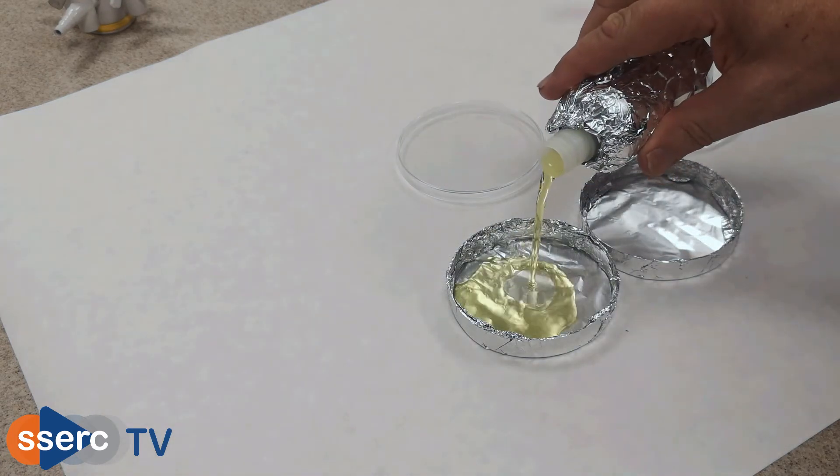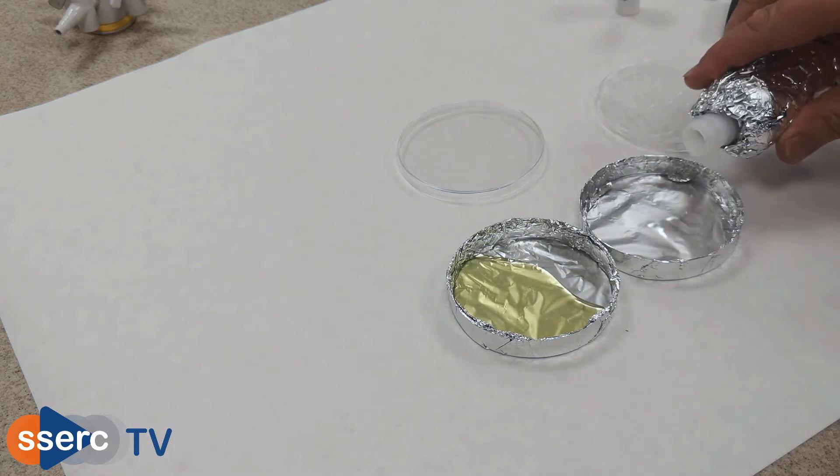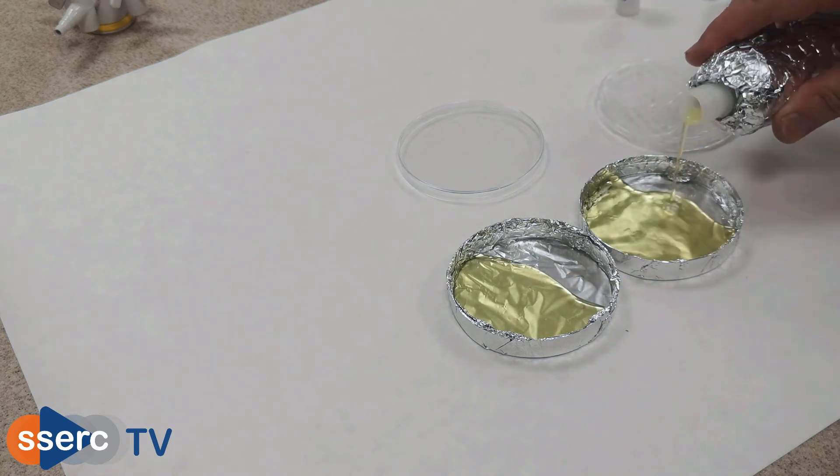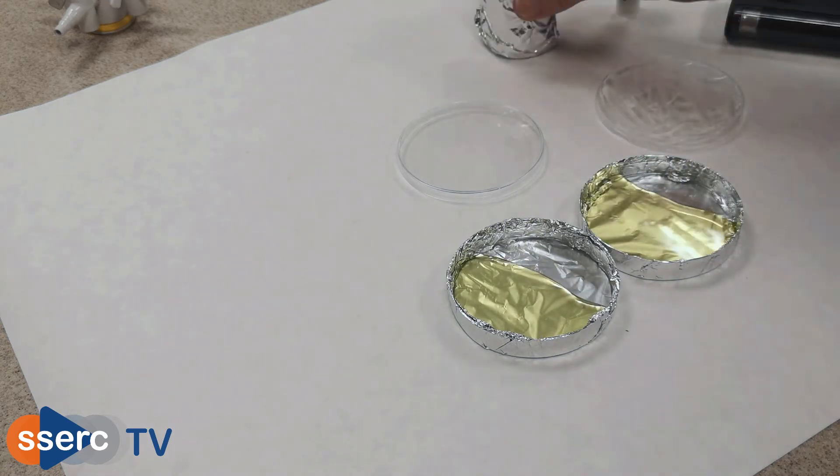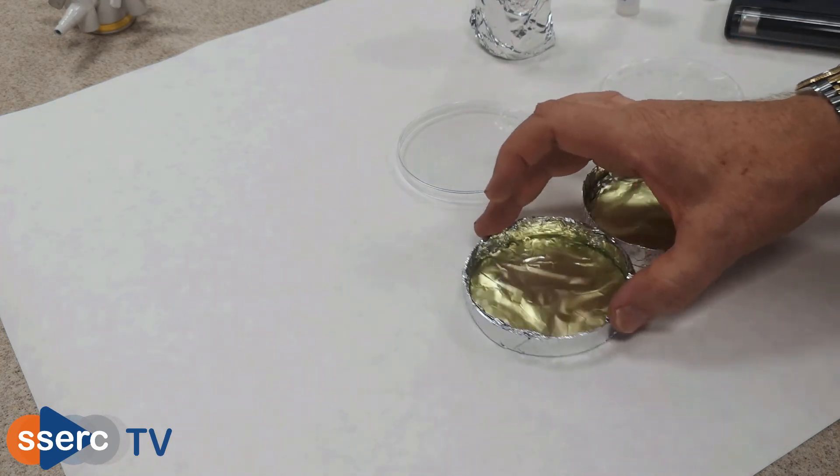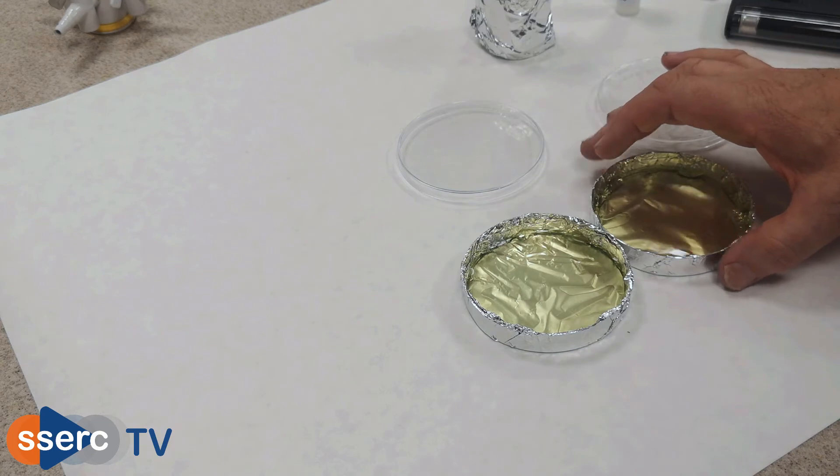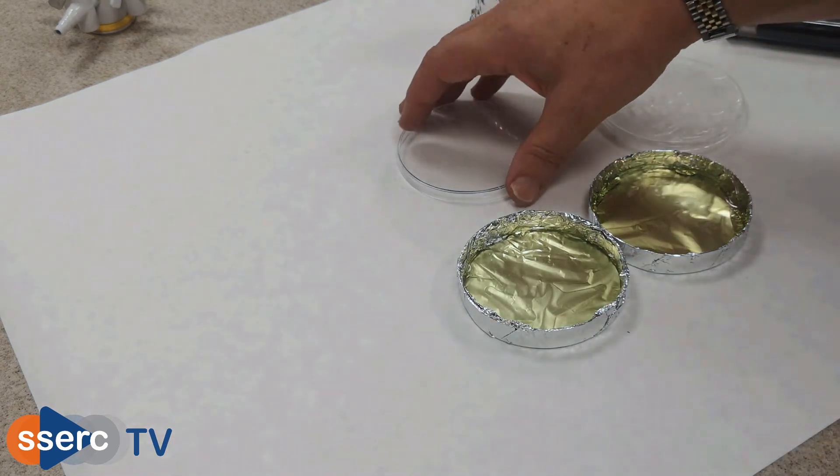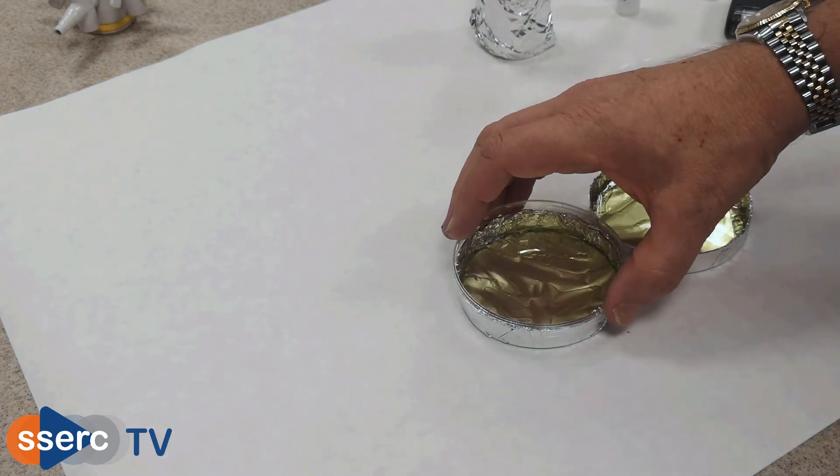Once you have the lids coated, pour a small amount of solution into each of your petri dish bases. The 80ml you have allows for 20 in each, which is enough. For the moment you can just do it by eye, as long as they're roughly the same all will be well. A quick swirl will get it spread evenly over the base.